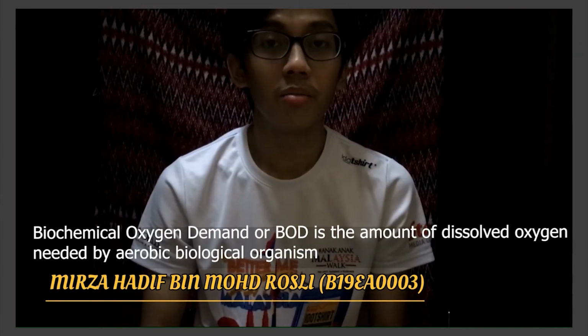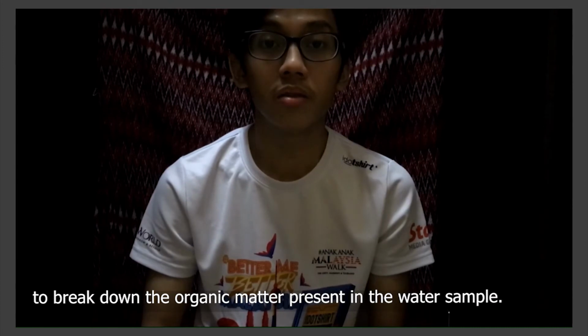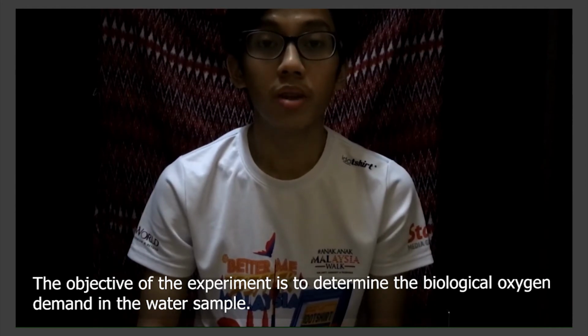Biochemical oxygen demand, or BOD, is the amount of dissolved oxygen needed by aerobic biological organisms to break down the organic material present in the water sample. The objective is to determine the biochemical oxygen demand in the water sample.